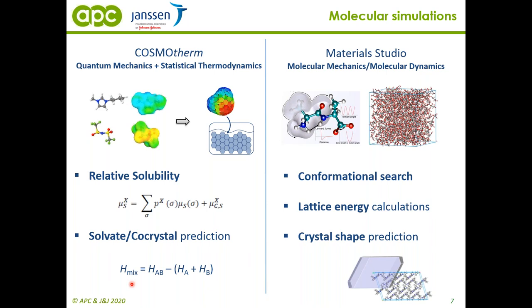So this can be used during the screening for the identification of potential unwanted solvents. As a second method, we are also employing molecular dynamics. This is now based on molecular mechanics instead of what I previously introduced on electron density. And here atoms have point charges.